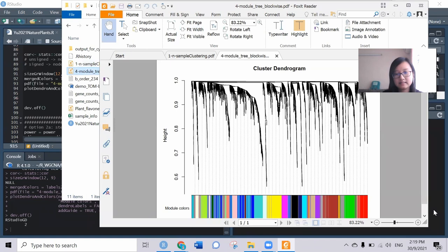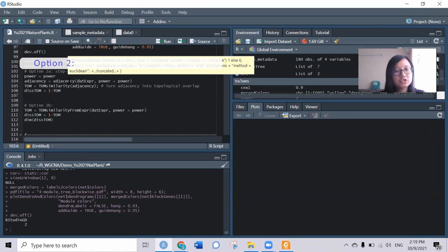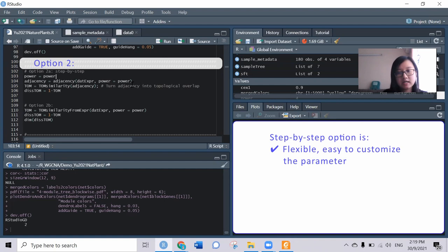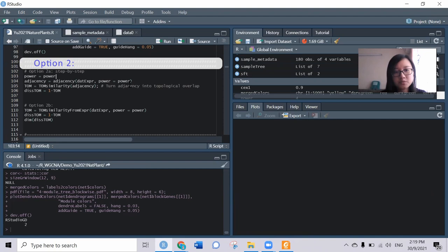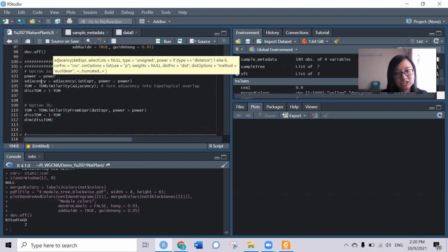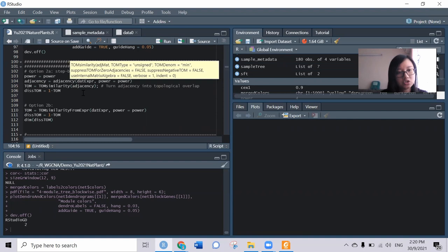Now we can proceed to the second step. The second step gives us more flexibility to adjust the power and other thresholds needed to construct the network. In this option, they have two types of functions. The first one is we need to run the adjacency function to get the adjacency matrix, then use the TOM similarity function to calculate the topological overlap matrix and get the similarity.